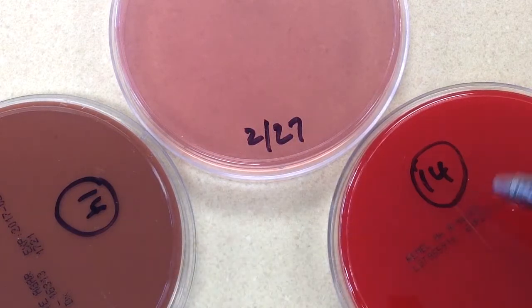We have chocolate, sheep blood, and MacConkey's plates. It's possible that a CNA would be set up in a laboratory — in my laboratory, I just use this particular setup.